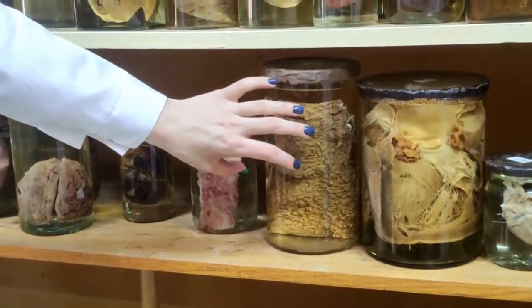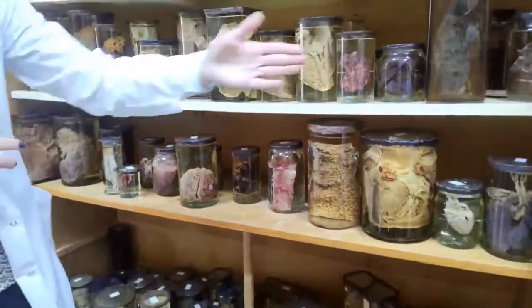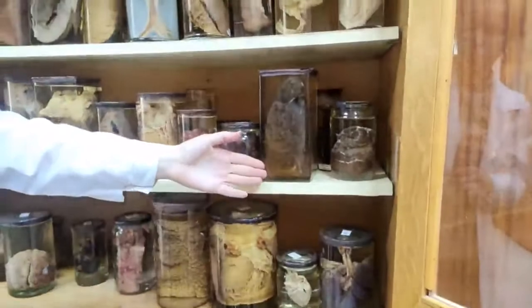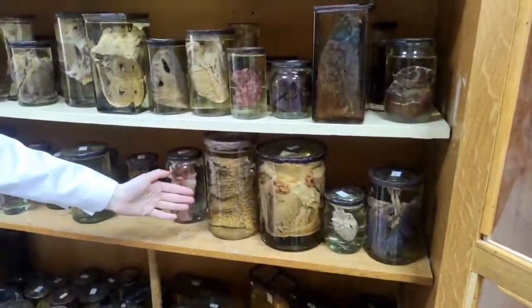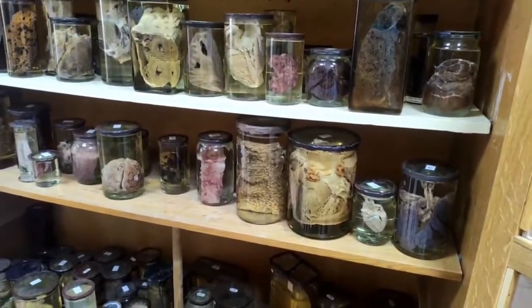I told you that there are two types of fibrinous inflammation: croupous here in lobar pneumonia and diphtheritic here in shigellosis. Colon. In colon, yeah.